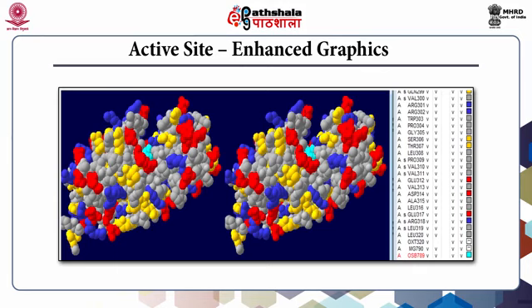In the protein structure module number 11, we have already seen that most of the surface of the protein is hydrophilic and the interior is hydrophobic, and all the functional sites, maybe the active site of an enzyme or the binding site of a receptor, are present within clefts, maybe formed by two lobes of the same domain or two domains of the same subunit. Therefore, this now shows that the active site is actually present on the surface within the cleft and is hydrophilic, having residues which have mobility for their functioning, that is transformation of the substrate to the product.